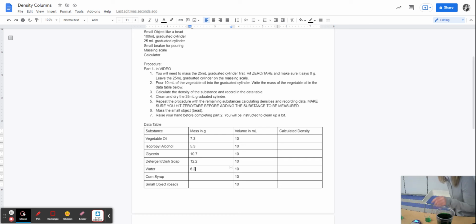Okay. There we go. Okay. It is 9.7. So not 6.2, but 9.7. So I redid that one for a reason, so I'll explain later.